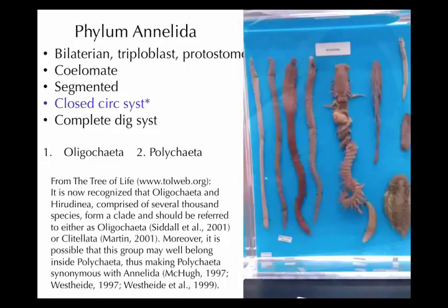There's two groups. You might have seen three groups on the poster, but really there's two groups, and that's how they discuss it in your book. The oligochaetes, or oligochaeta, and the polychaetes, or polychaeta. You can see here, this is an oligochaete. That's the earthworm. And then all these have more little projections on them we'll talk about in a minute. Those are all polychaetes. So those are the most common of the annelids. Even though we mostly think about earthworms, they're actually mostly polychaeta.